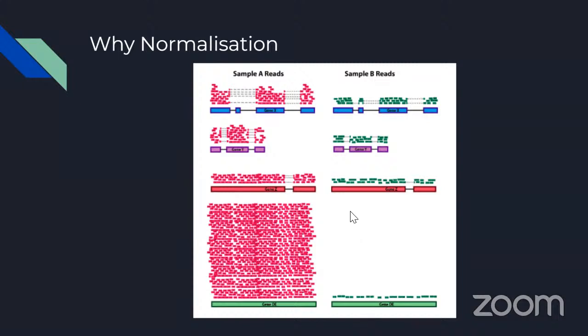So what we want to do at this point is to normalize these counts. Once we normalize, we can compare within a sample, between samples, or see whether it is actually a differentially expressed gene, or an anomaly caused by the difference in depth in different samples. For example, when you want to compare the same gene between two samples, it would make sense to divide by the total number of reads that are present in everything.